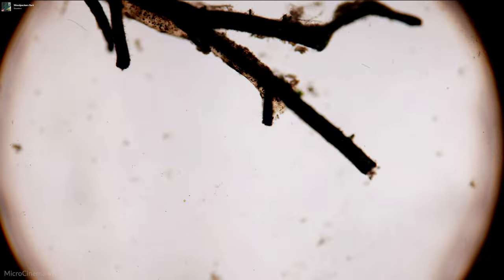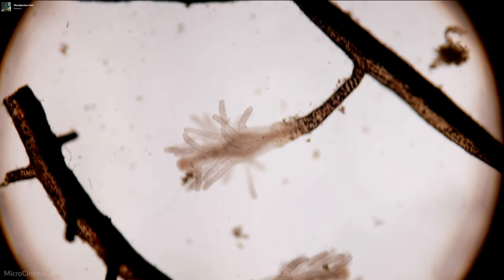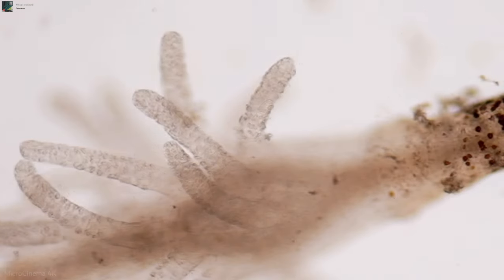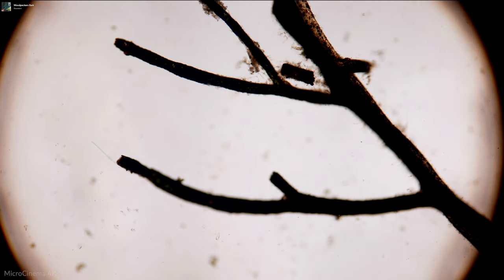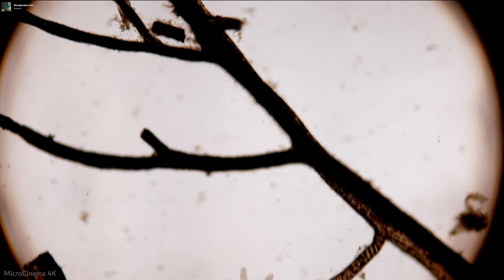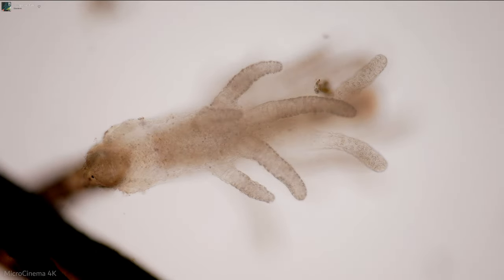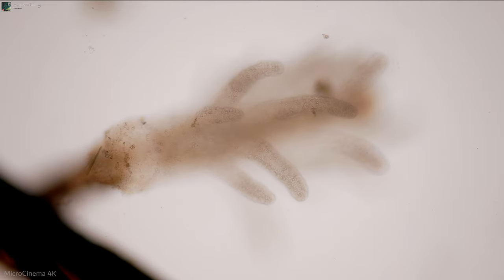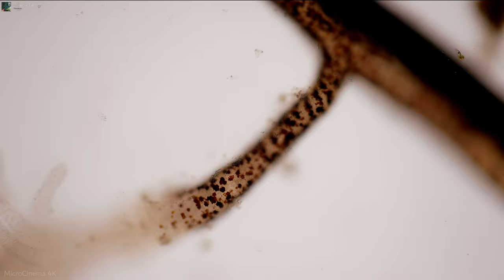I don't know. Looks like roots. It could be. Yes, it just doesn't, you know, roots typically, plant stuff, you have these really obvious square cells. Hey Jason, welcome in, cool name. And this just looks squishy. It looks too squishy to be a plant. And even when you look at these little tube structures, those even look kind of weird.